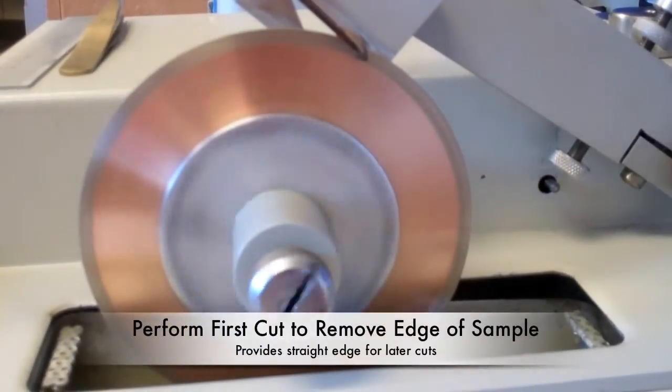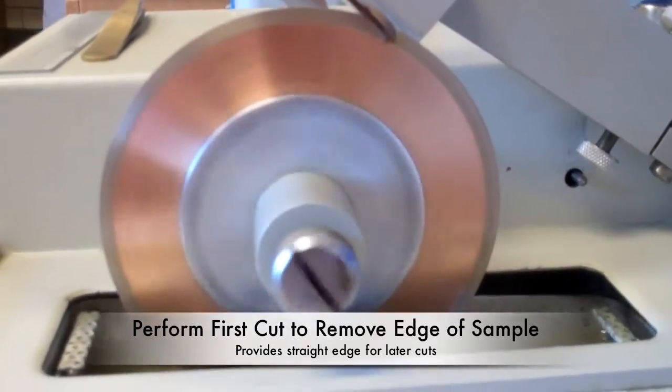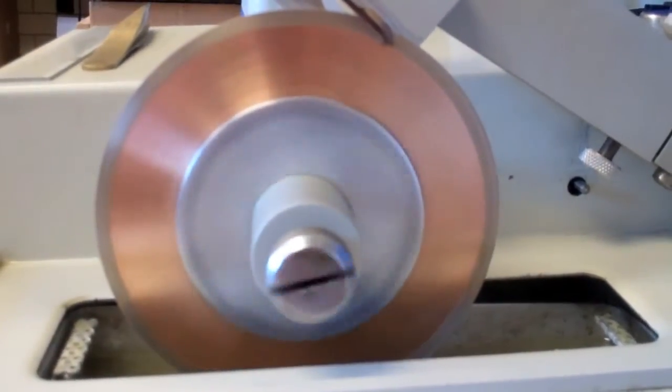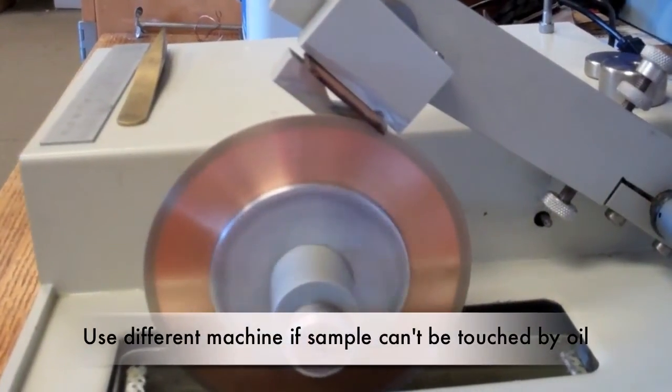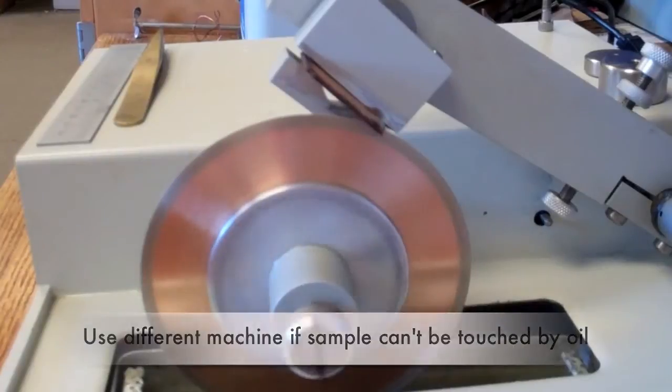First, the excess edge of the sample will be removed to create a straight edge for the successive cuts. During the cut, oil is lifted onto the blade of the sample. If your sample is not compatible with oil, a different instrument may need to be used.